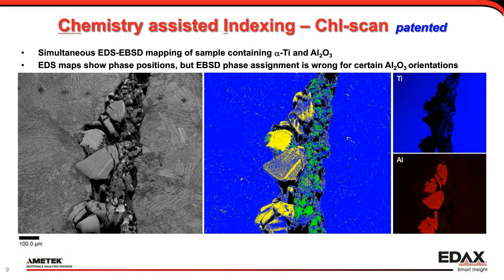Now, note that the twin lamellae are correctly identified, even when the main body of the grain appears speckled. This is caused by orientation-specific pseudosymmetry. In some cases, EBSD patterns of different phases, even with different crystal structure, may appear very similar for certain orientations, while other orientations are so different that phase discrimination is not a problem.